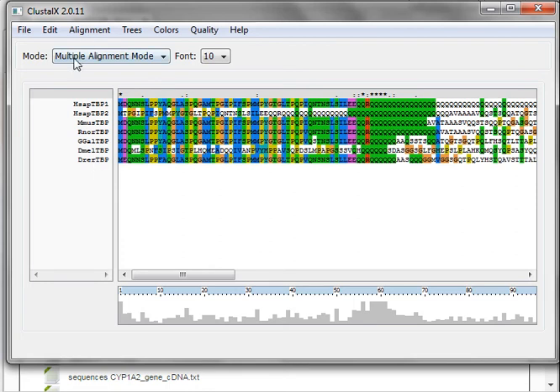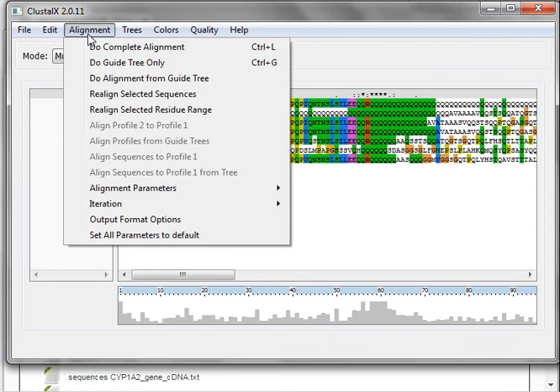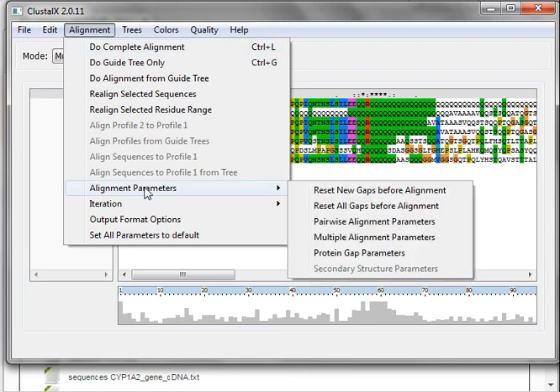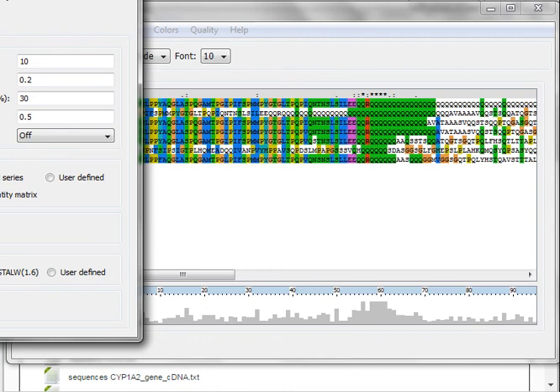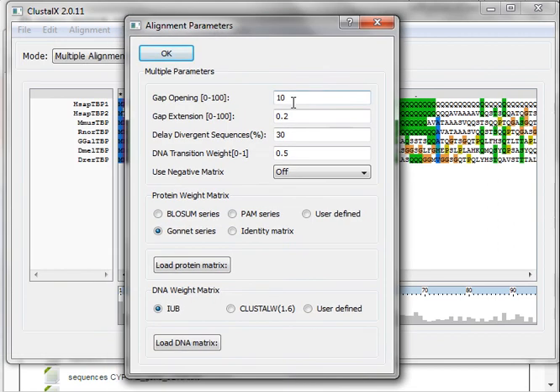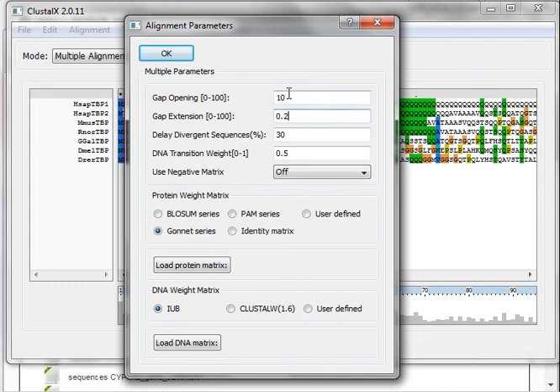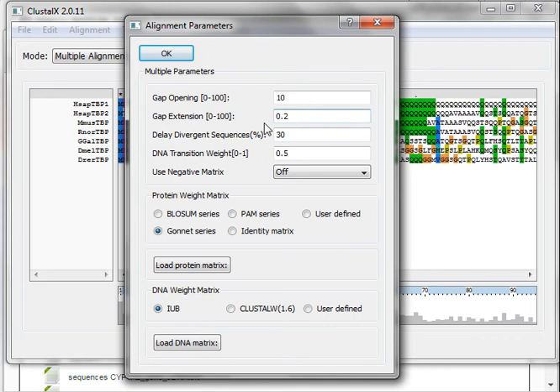Now you will perform the complete alignment. But you should first set the alignment parameters. So the alignment parameters should be selected for multiple alignment. In multiple alignment parameters, you can choose the gap opening penalty, the gap extension penalty. Most of the times it is tenfold difference. So this time we'll use as default. But gap extension should be very low in order to get a good alignment with all the extension of the sequences.